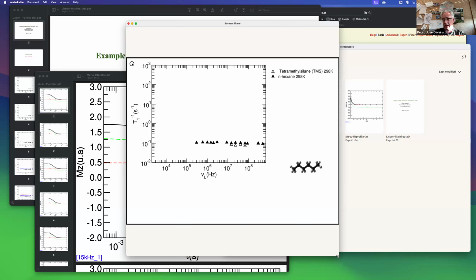It's a slightly elongated molecule, just with carbons and hydrogens, a rod-like thing. You can find this same compound in a cycle, but this one was chosen to be rod-like. And the relaxation rate is slightly higher than the previous one and is rather flat.